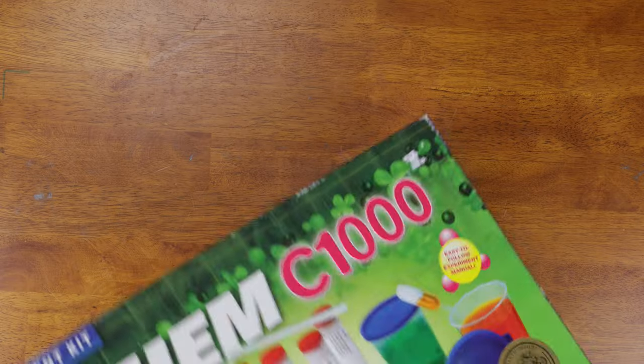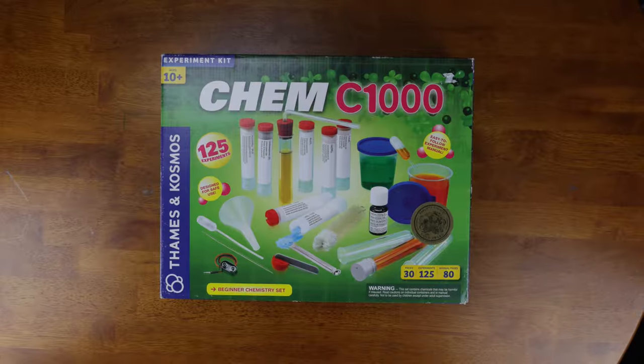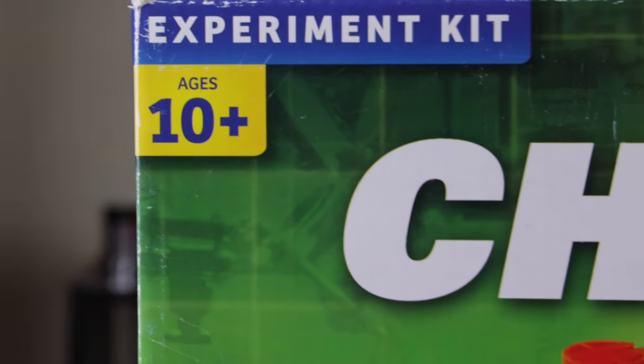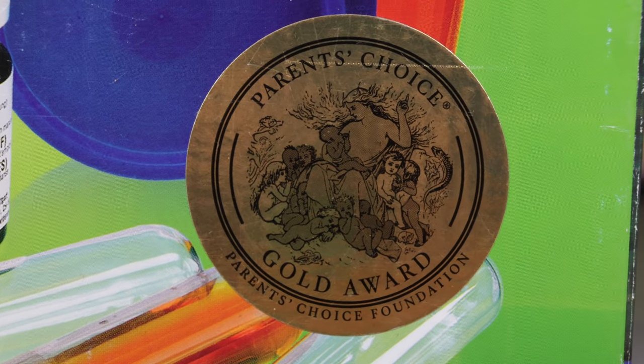Today we're going to be talking about the Thames and Cosmos C1000 Chemistry Kit. This kit advertises 125 different experiments for ages 10 and up, and has received the Parents' Choice Gold Award.